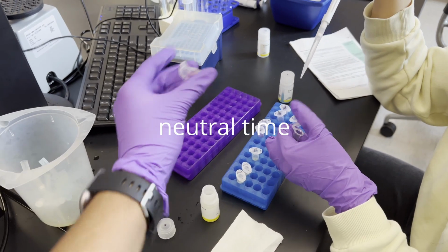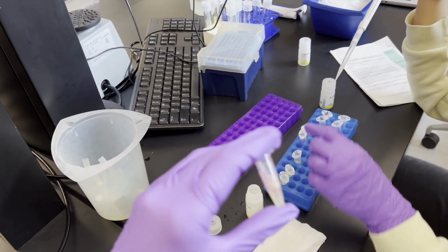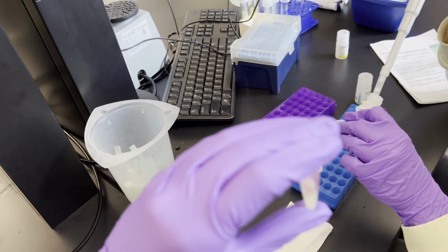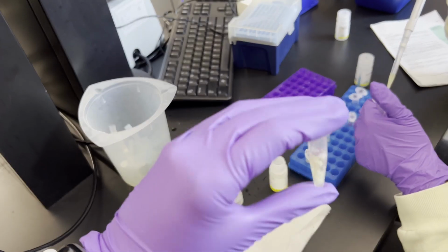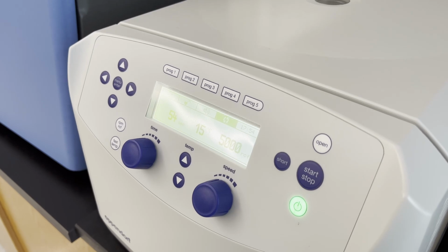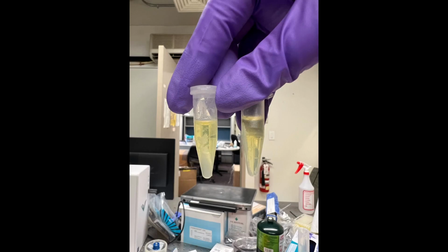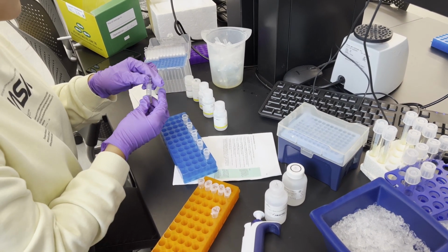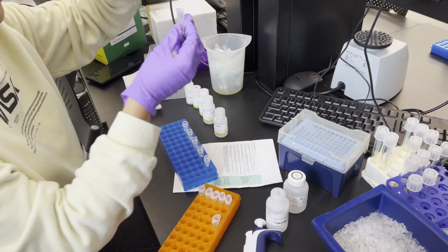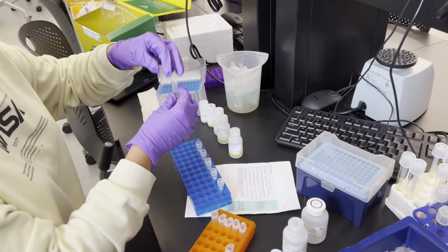Now we will add the neutralization buffer and carefully invert to mix for this step. The cell waste becomes a visible precipitate. Be patient and invert until the color fully changes. Now we will centrifuge again, and this time the pellet is waste, so be sure to not pour away the supernatant because it contains the plasmid DNA. Carefully move the supernatant to a column, avoiding the pellet because the goal of the mini-prep is to separate the cell waste from the plasmid DNA.